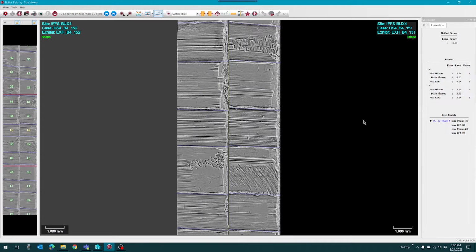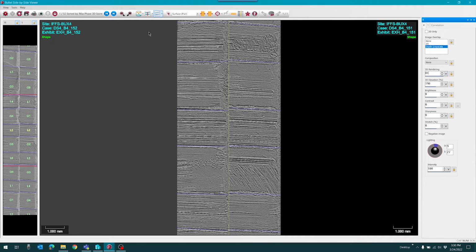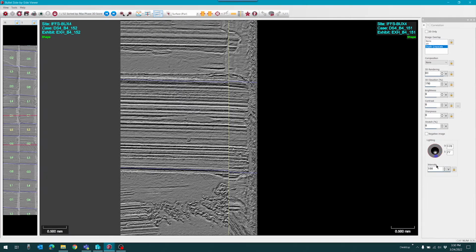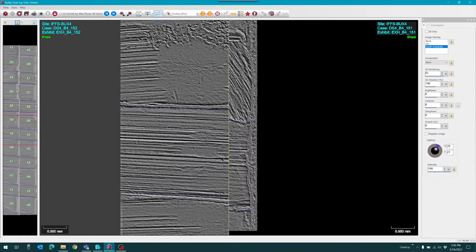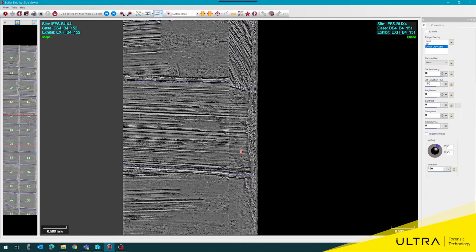I'm going to go all the way back up to the very first one here, because when I see something like this, at this point, this is when I would stop, move my hand away from the keyboard, grab the mouse, and actually go and start playing with my visual tools here. I would zoom in, I would bring this in for a comparison, I would play with that side light, and bring this around, even explore around the surface itself. Let's lock these two together, look at 6 to 3, see if the comparison still holds well for the full phased wraparound here.